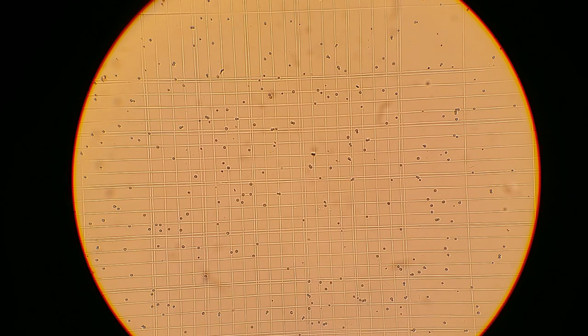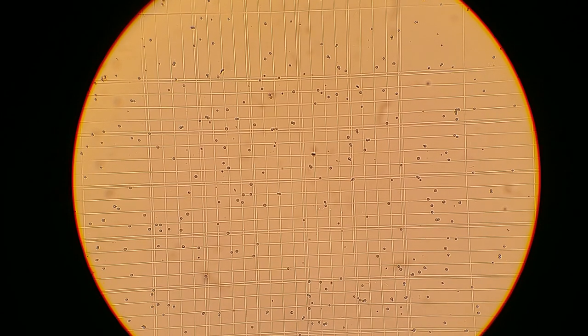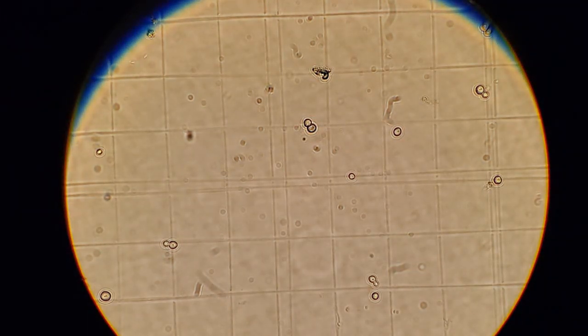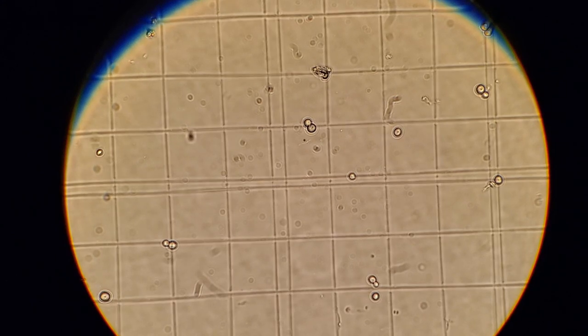In this episode I'll be showing you how to perform cell counts using a hemocytometer. I will also show you how this can be combined with viability staining using Tri-Pan Blue to get a more accurate measure of your true pitch rate.